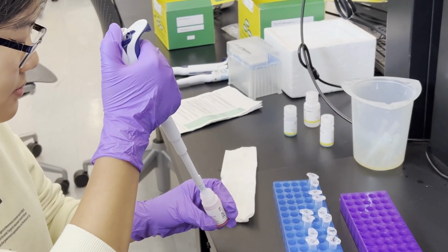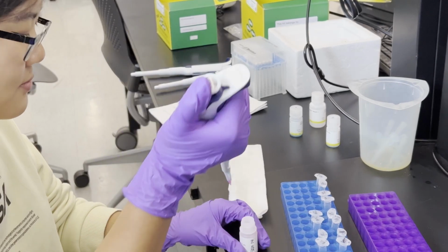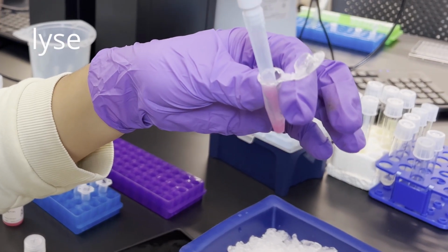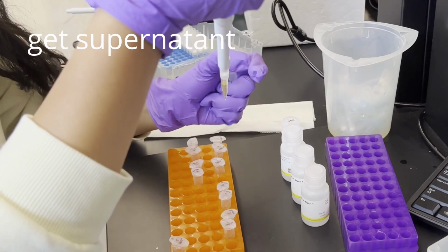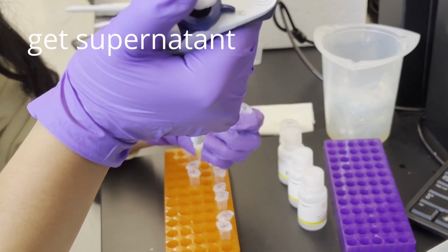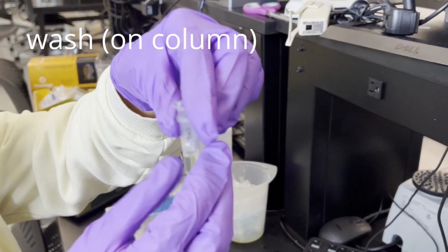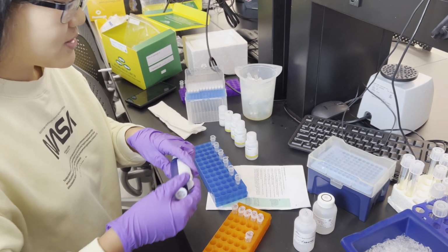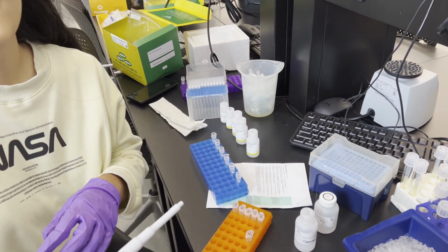From here, we start the mini-prep. The exact buffers vary from each company's kits, but the general idea is the same. We lyse the cells to release the plasmid, neutralize, remove the plasmid containing supernatant from the cell waste pellet, and wash to remove any other contaminants. Each step has its challenges that can affect yield, or at worst, you can accidentally wash your DNA away.